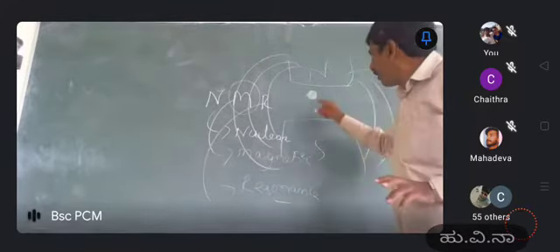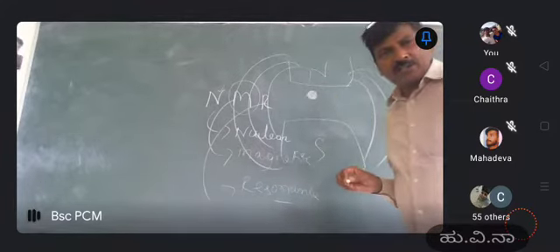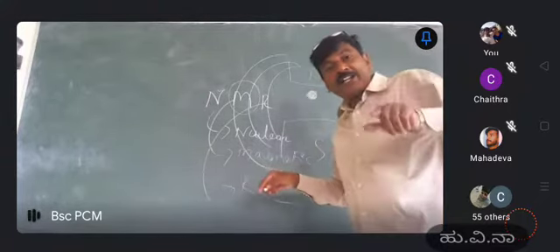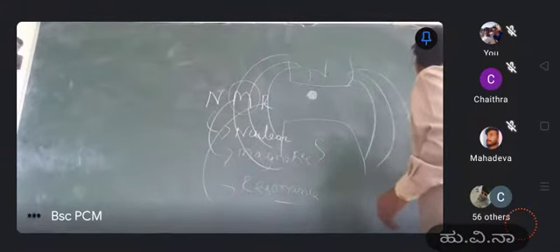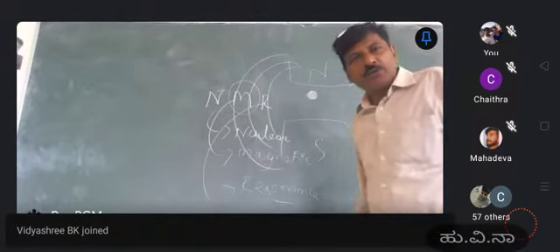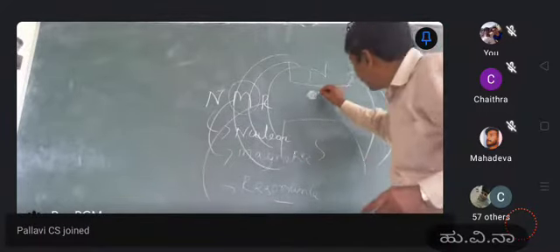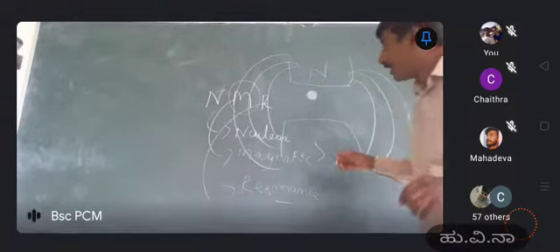Now this is the nucleus. This interacts with electromagnetic radiation, especially radio waves, RW. If this radiation is capable of interacting with the nucleus, we call such an interaction resonance.